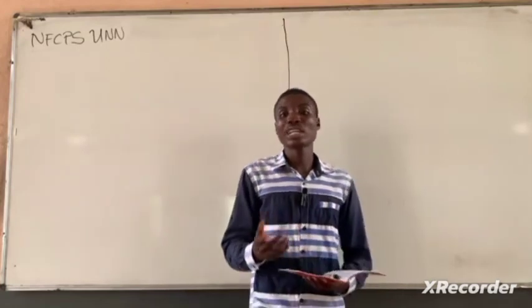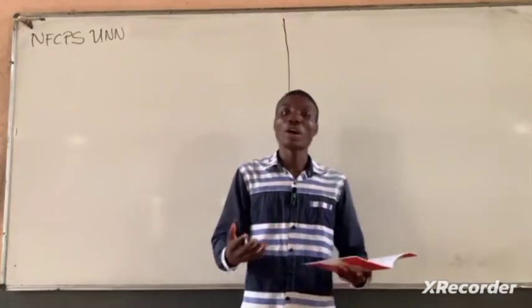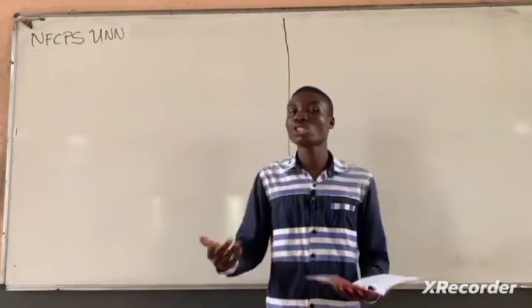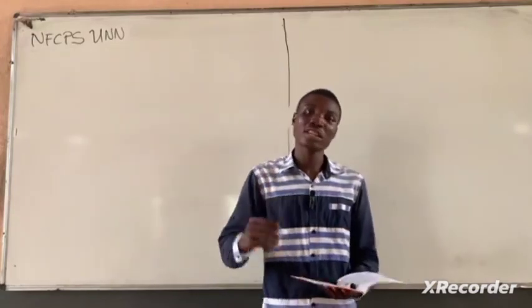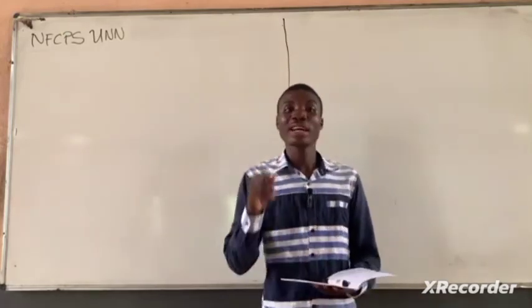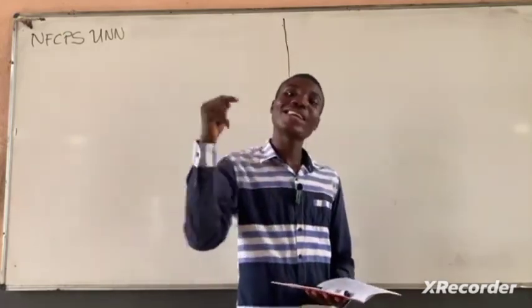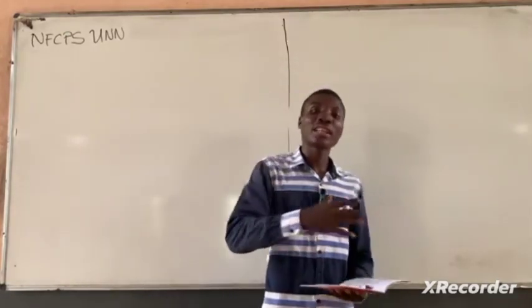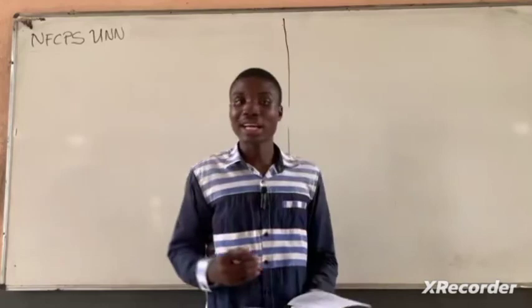But then in your alternative to practical, you may be asked a question that has to do with the uterus, and then you're asked what kind of physiological salt solution, that's PSS, is used in that case. Tyrode's solution obviously is going to be wrong there. The answer to this particular question is in your manual. So go ahead and look it up and master that, as is necessary for other kinds of tissues.